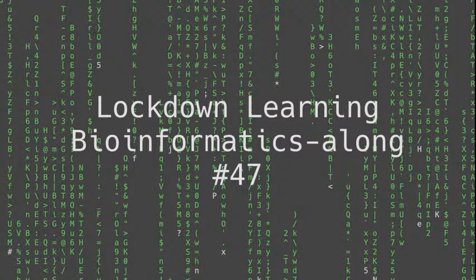I have a lot of data on my local disk that I want to visualize in its genomic context, and I don't necessarily want to have to upload all of that data to some web accessible location so that I can look at it in the UCSC genome browser or in Ensembl. I want to be able to view it directly off of my local disk, basically. And this is where a standalone genome browser will really come into its own.